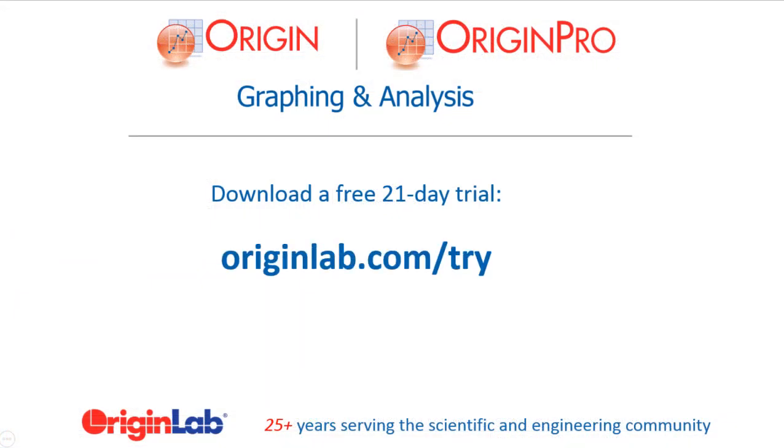Download a fully functional trial version of Origin today, and see for yourself how our user-friendly yet powerful interface and tools can help you to visualize, explore, and analyze your data.